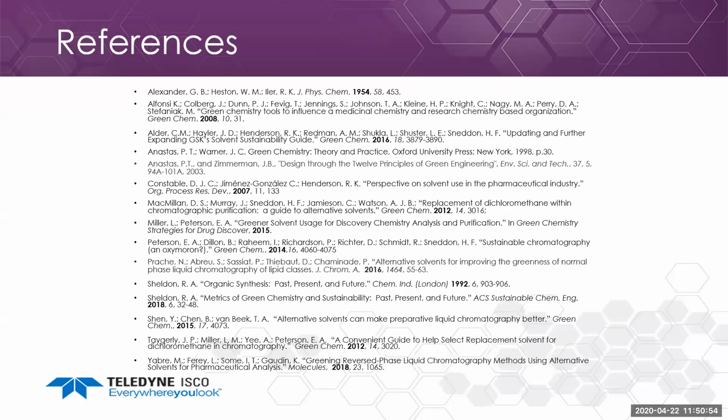In RF, 1 CV is about 0.1 difference, so CV is going to be 1 over the RF value, so 0.1 would be an RF value where you'd be able to get a decent separation. If that's larger, like 0.2, 0.3, that separation is going to be even easier. So if you can get above 0.1, you can usually get good separation on your column.